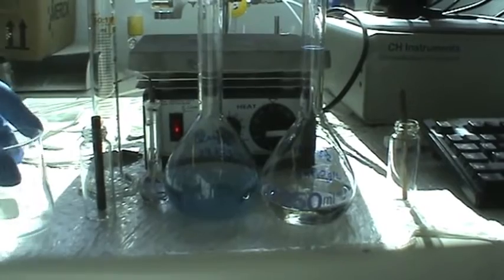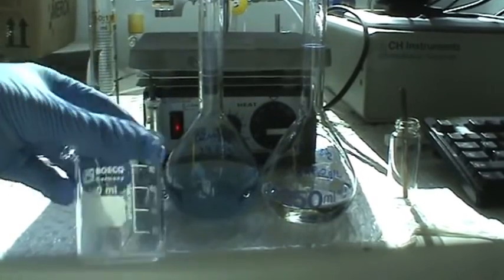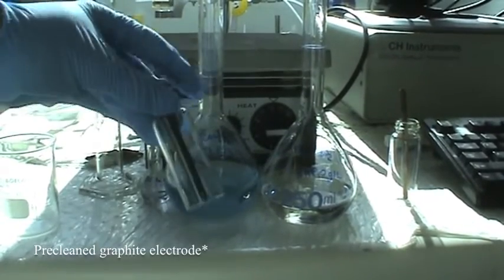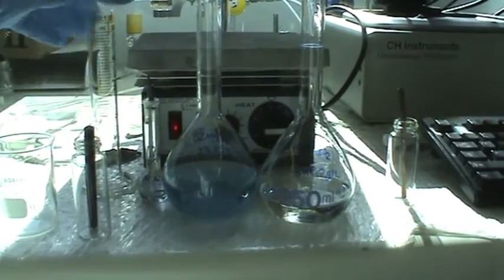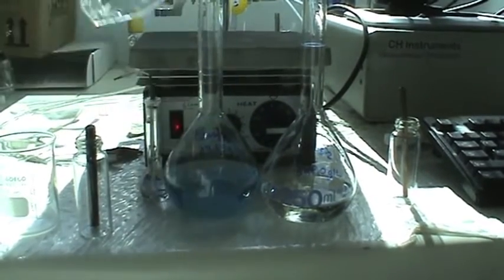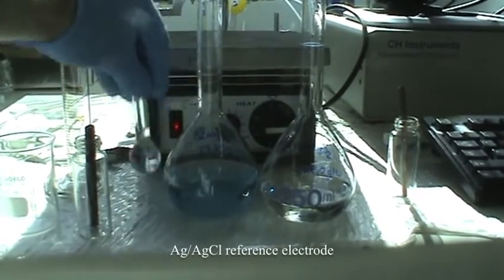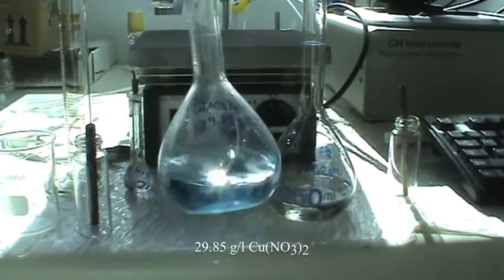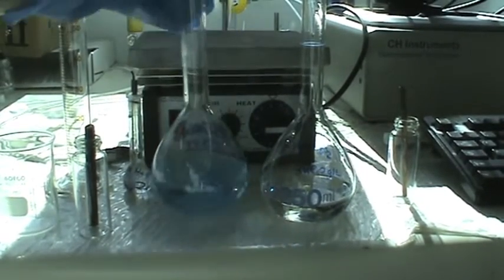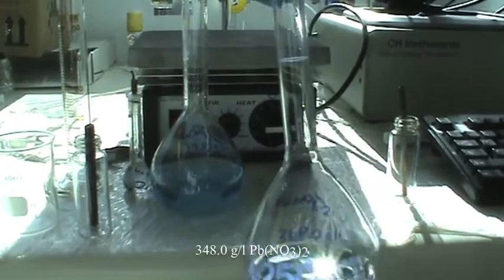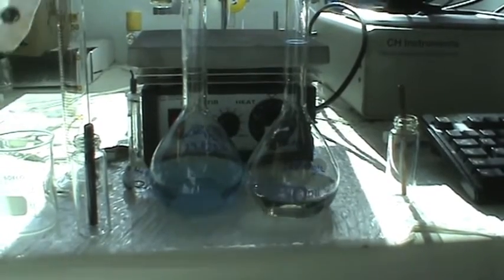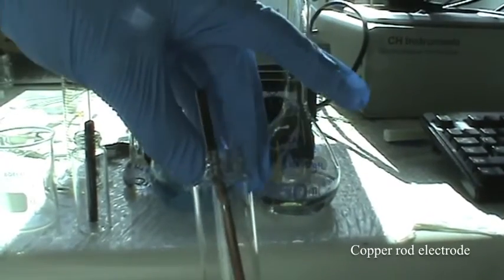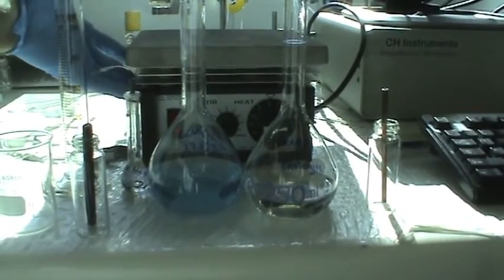To start, get a 100ml beaker, a pre-cleaned graphite working electrode, a measuring cylinder, a silver-silver chloride reference electrode, a 29.85g per litre copper nitrate solution, a 348g per litre lead nitrate solution, a copper rod counter electrode, and a heating mantle.